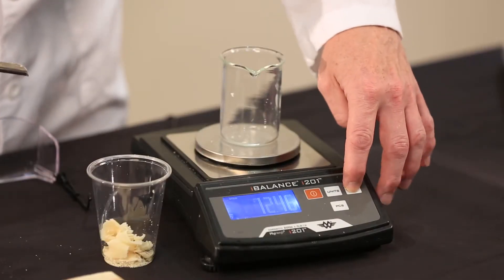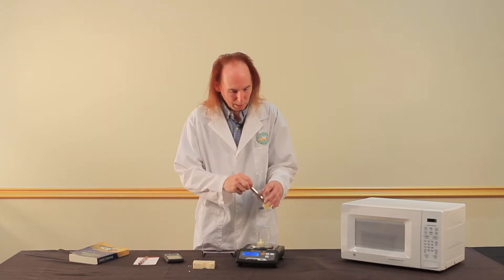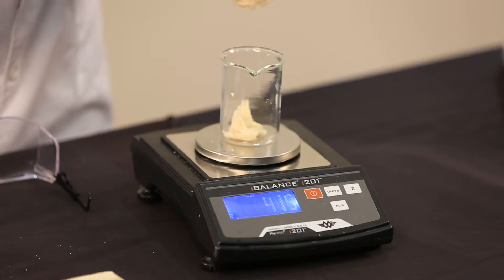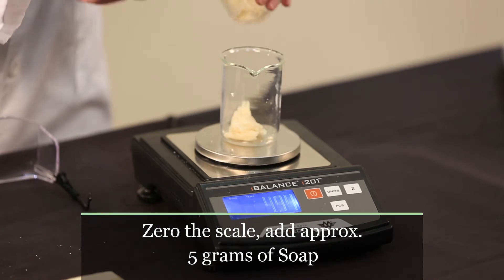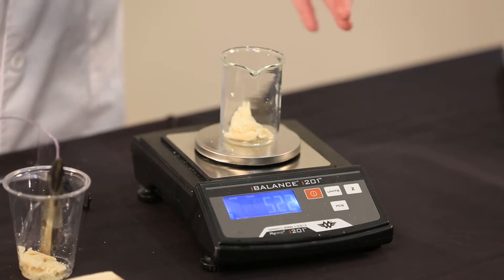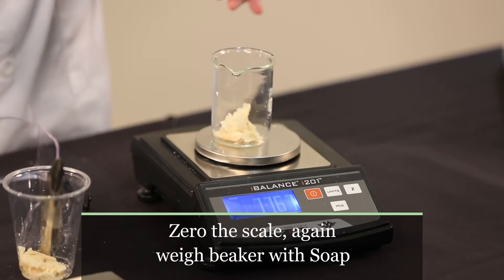I'm now going to zero the balance again and weigh some soap into it. There's 2.56 — I'd like to have something close to five grams. 4.15. 4.94. I don't have to hit the target exactly, but five grams is a pretty convenient amount. I've now got 5.22 grams. What I want is the weight of the beaker with the soap, so I'm going to zero it again. This is now 77.67 grams.